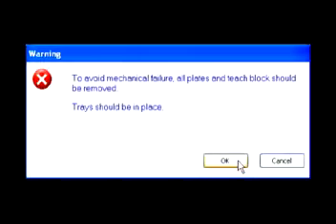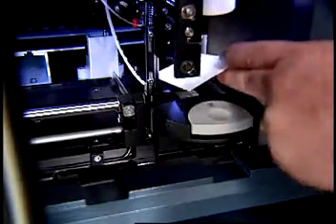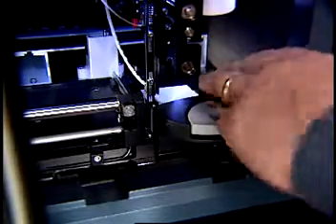Click Start. A warning message appears instructing the user to remove all plates and teach block while leaving the tray in place. Click OK. To easily and efficiently achieve the correct needle setting, slide a business card under the needle.